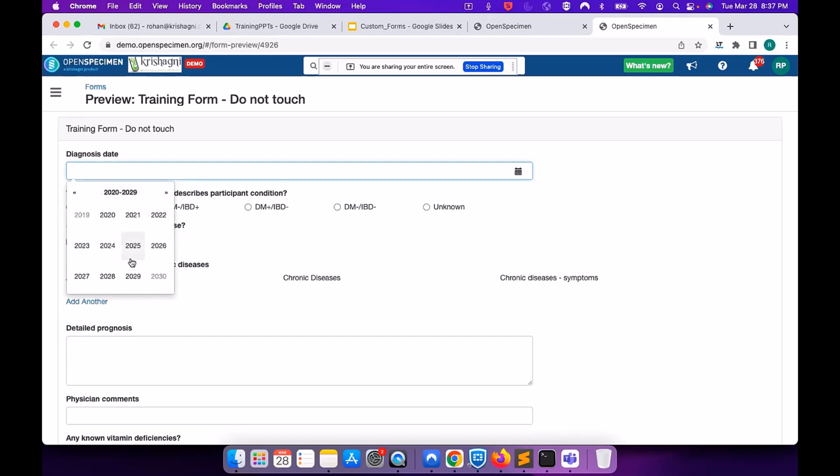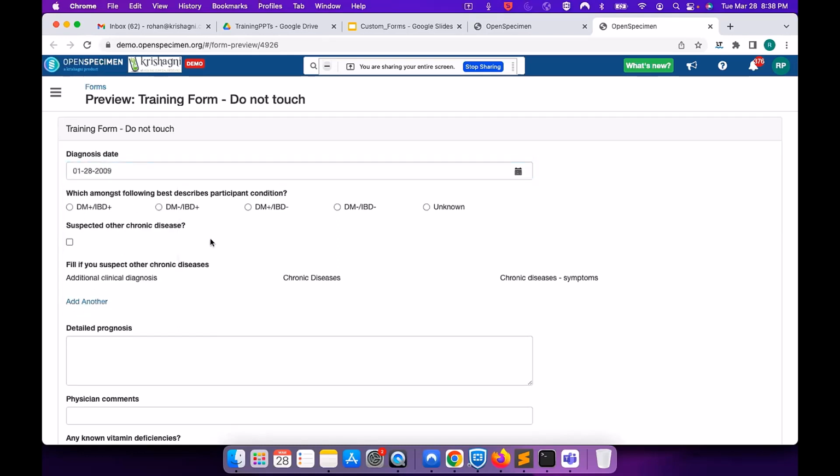Sorry, I need to go into, yeah, 2009. Yeah, this looks okay.